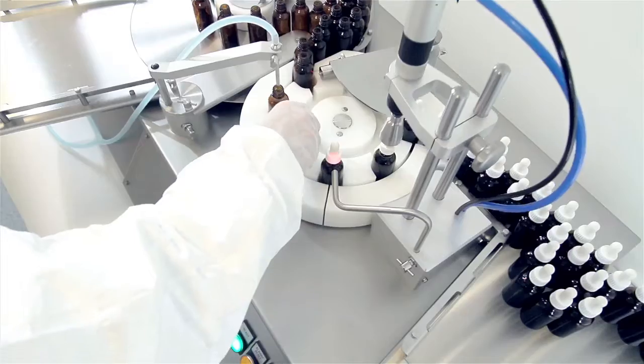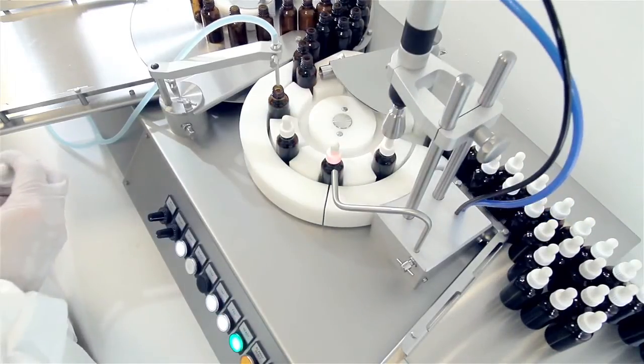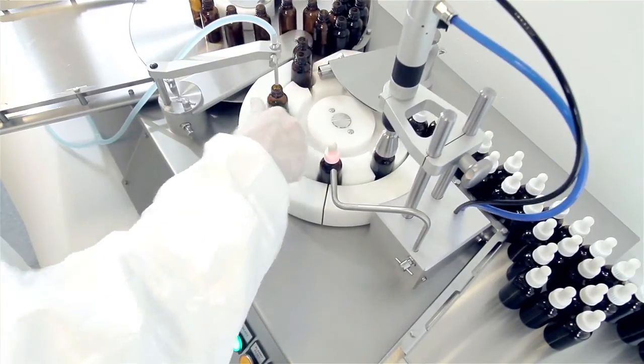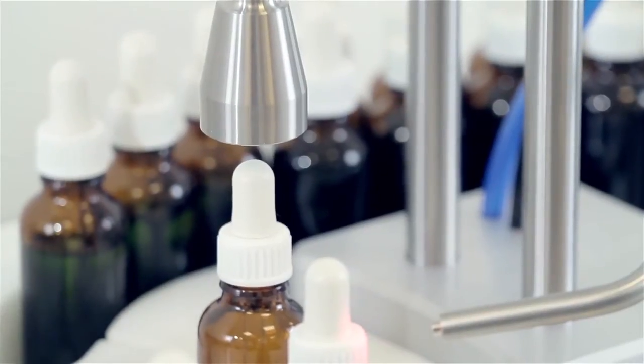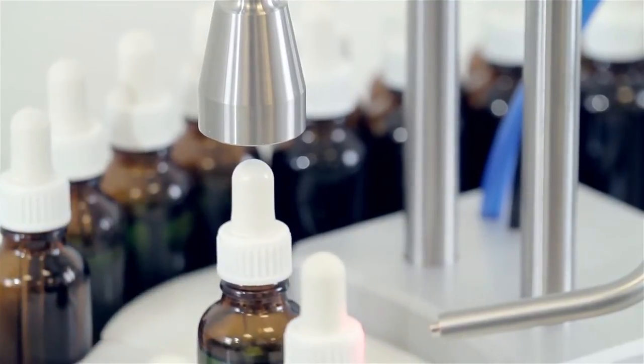Filled and capped bottles leave a standard FlexFeed 30 on trays. However, the machine can be customized with bottles being fed onto a conveyor into a labeling machine, further improving productivity.